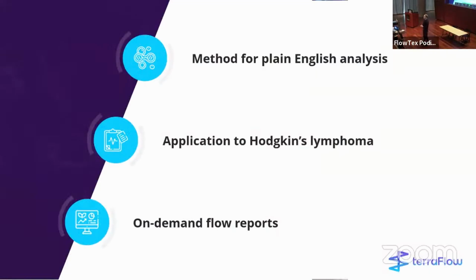Today, I'm going to tell you about a method I developed that can take any single cell data set and explain it back to you in plain English. I'm going to show you how we used this method to do a major study of Hodgkin's lymphoma in-house with a core of four people. And I'm also going to show you a platform we developed to make this tool available to everyone.